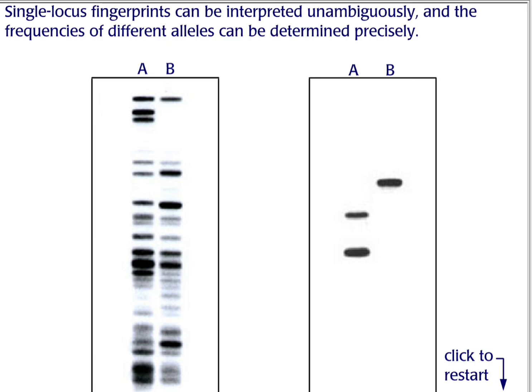So this is the multi-locus fingerprint on your left side and the single locus fingerprint on your right side. The multi-locus fingerprint technique was developed by Alec Jeffreys. The single locus fingerprint is the more advanced method which is used at the present time.